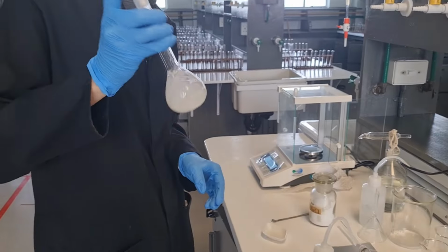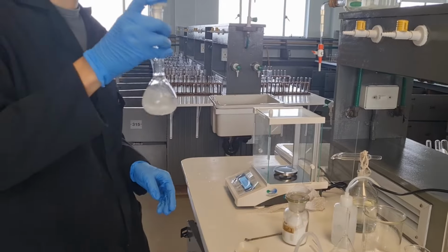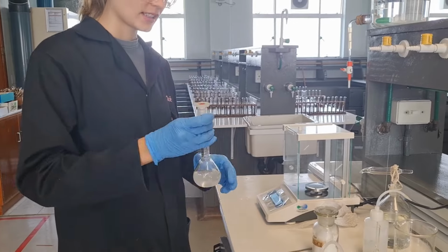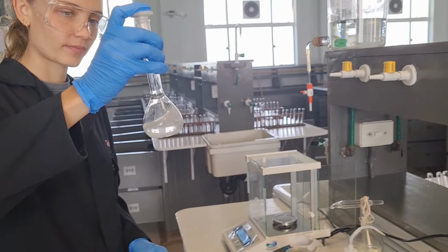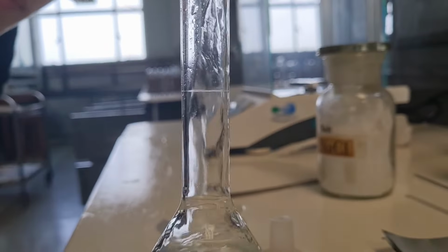Shake and mix the volumetric flask well until all the sodium chloride salt has been dissolved. This step is very important. Then make up the solution to the mark on the volumetric flask. Do not exceed the mark. Ensure that the meniscus is sitting on the mark.